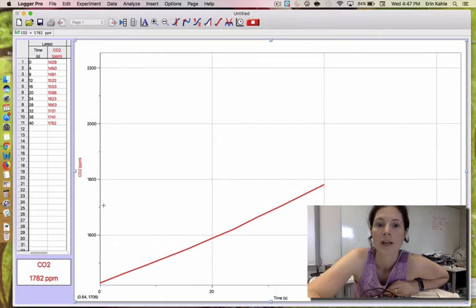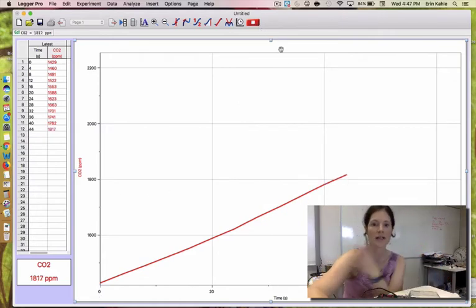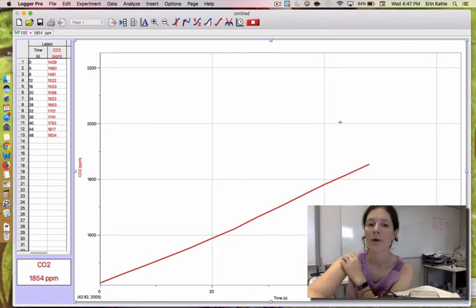So you get the idea, right? We've set it to collect for 300 seconds, so it's going to keep collecting. But you probably should have, and as we have, a straight line.